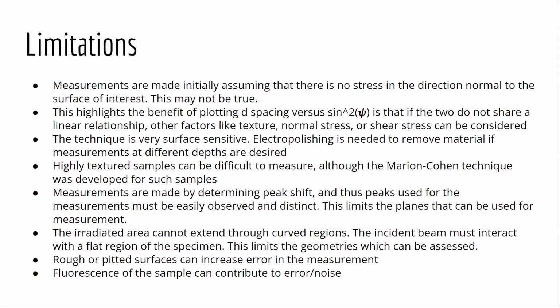Measurements are made by determining peak shift, and thus peaks used for measurement must be easily observed and distinct. And the irradiated area cannot extend through curved regions, so your sample should be flat, despite the fact that a lot of the times the areas of interest for residual stress occur in bends or at roots of threads, for example. And then if your sample will fluoresce, that can contribute to error or noise during your measurements.